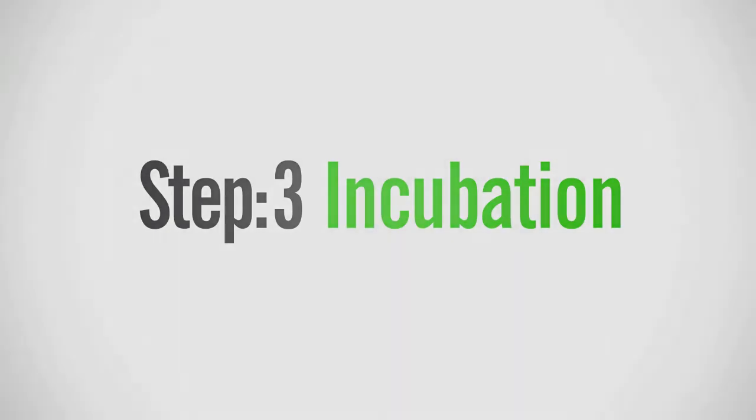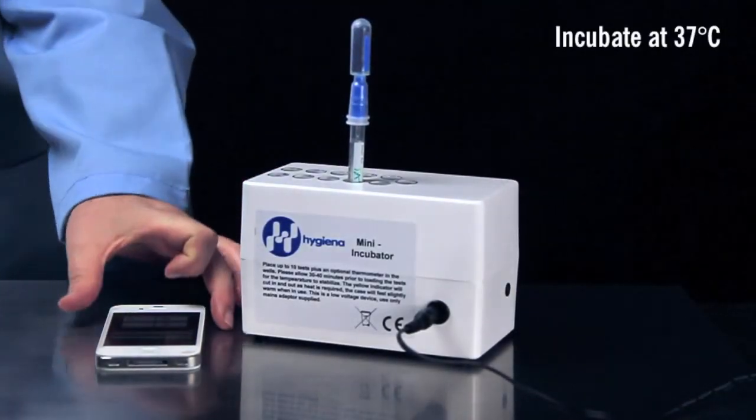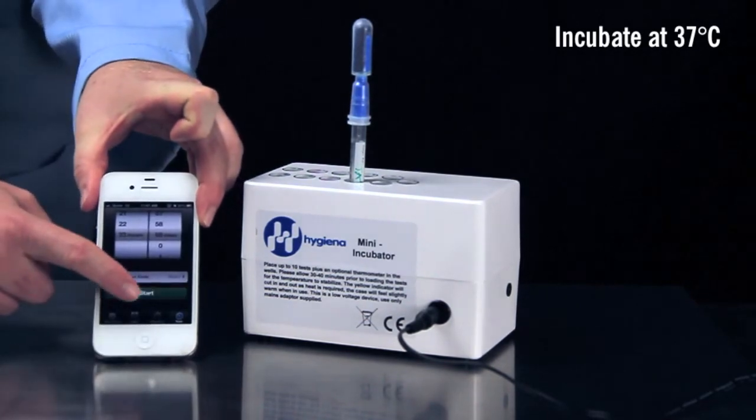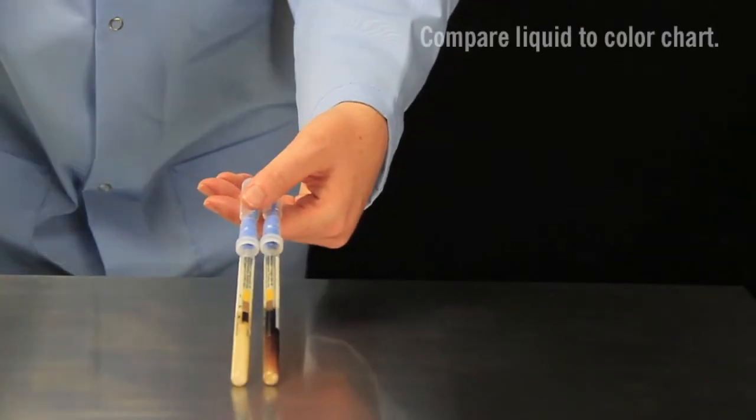The final step is incubation. Incubate Insight at 37 degrees Celsius for 24 to 48 hours. Positive results can be read as early as 24 hours.